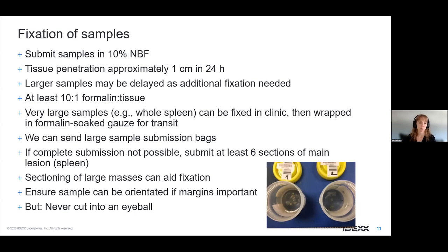We might just see necrosis, or maybe the dog also has a lymphoid hyperplasia, and we might miss the more sinister findings. So if you can't submit the whole spleen, which is most important for the spleen, then it's really advisable to submit a few sections.